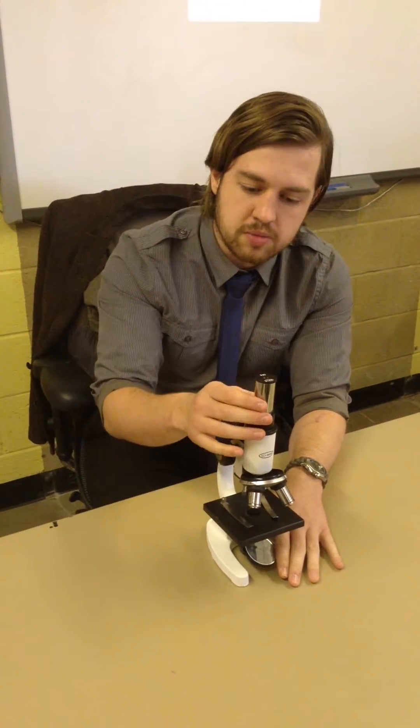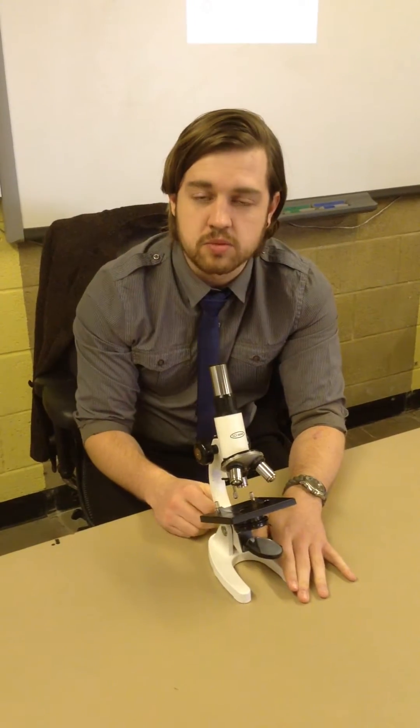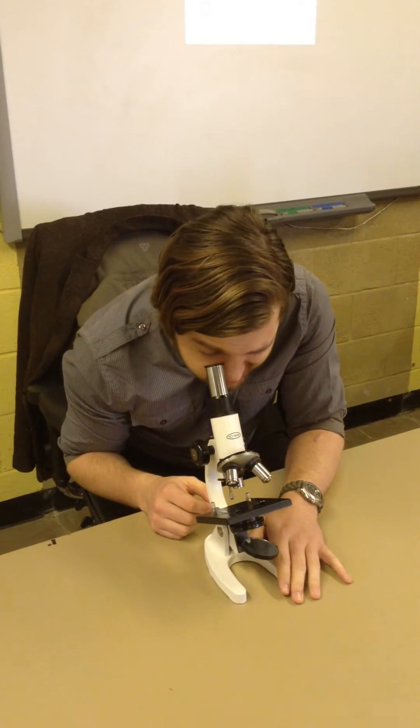And the last thing we have at the top here is the eyepiece lens. Now, the eyepiece lens is the part of the microscope that you look down. And that's it for the introduction to the microscope.